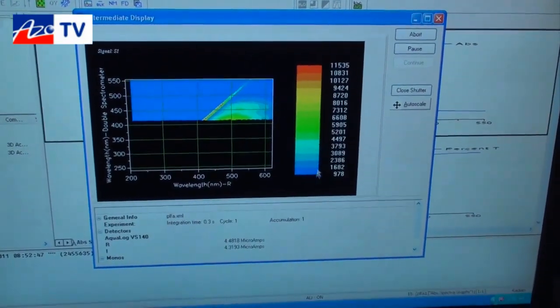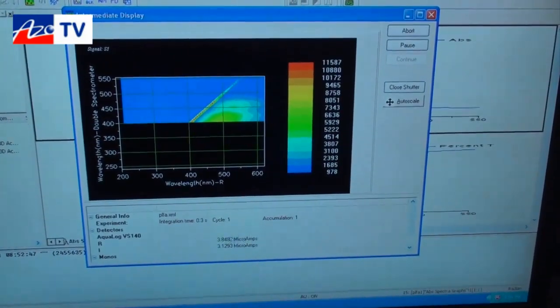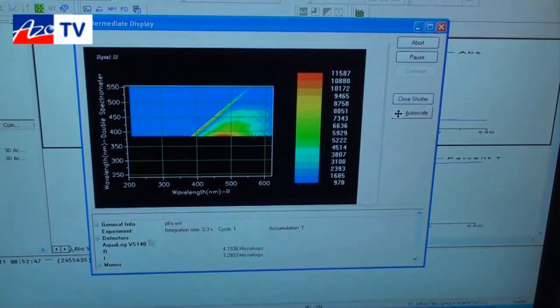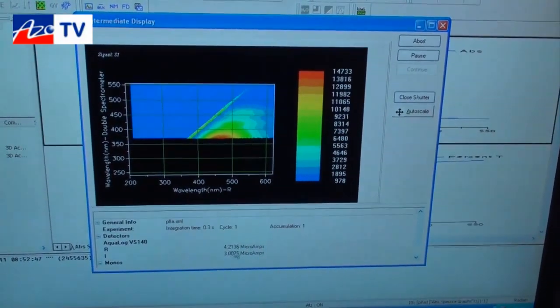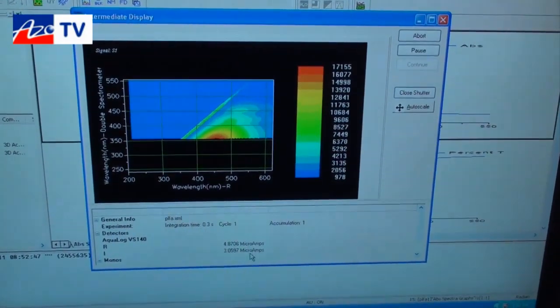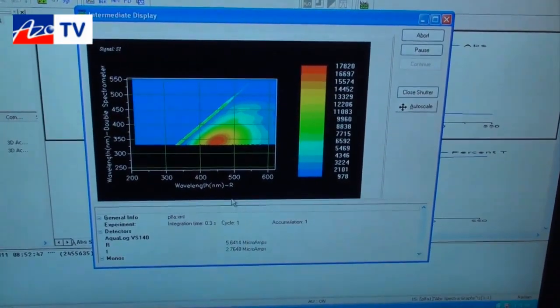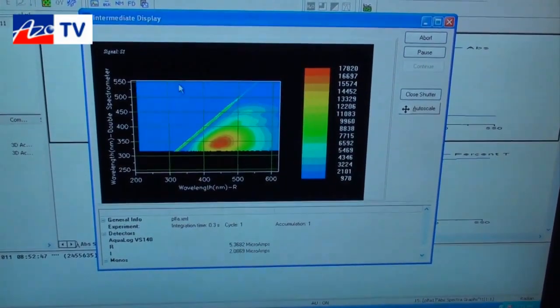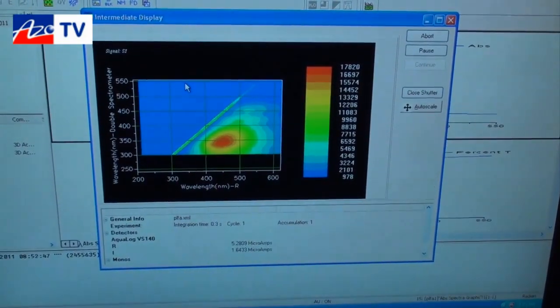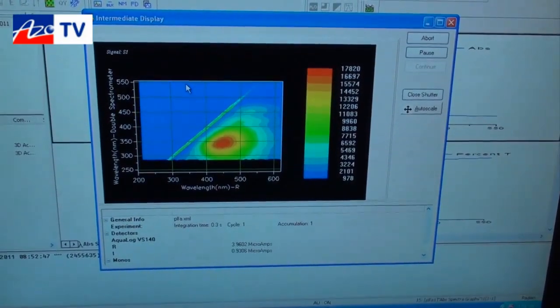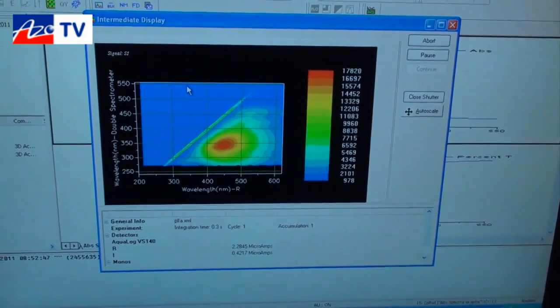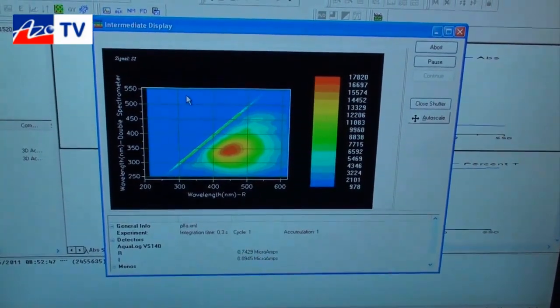This intermediate display gives you an on-running view of how the instrument is performing, what is the position of all monochrometers, spectrographs, and signal intensities as the data is being collected. Just one thing to point out is that previously with other scanning instruments, this particular measurement takes 20 to 30 minutes and up to two hours in some cases where samples are very dilute. And here we're able to do it in just a few seconds.